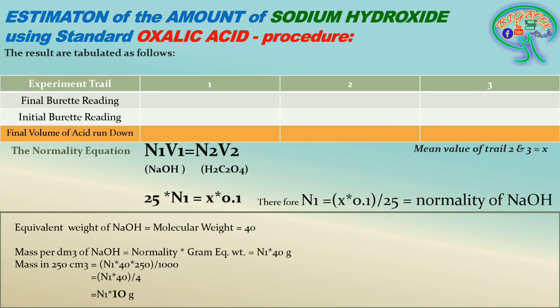So here, during this time we are going to consider two trials, and the mean of these two trials will be taken, and that will be the x here, because we have mentioned it to be the x, as we are having the empty values and no values. So we are going to consider it to be the x.